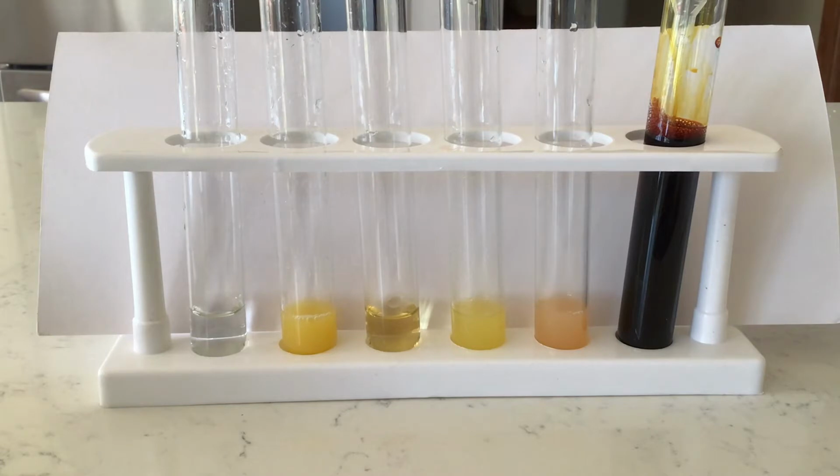Now the other 4, we're going to look at how much iodine it takes to react and use all of the vitamin C within that solution. The drops are going to help us know how much vitamin C is based on calculations we will do later. So what I'm going to do is add iodine drop by drop to each of the solutions that you see. And between each drop, I'm going to shake the test tube, and that way I can allow it to react. As the iodine is added to the solutions, it's going to react with the ascorbic acid, and it's going to get to a point where there's no more vitamin C left in the test tube that I'm using.